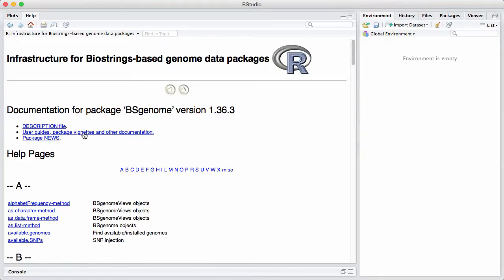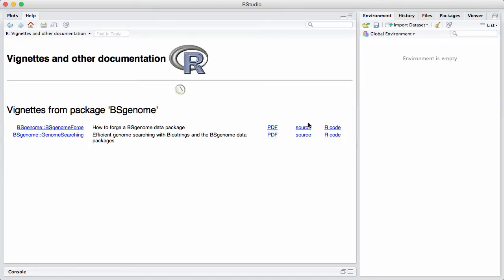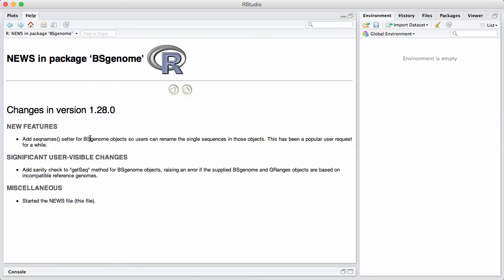So let's click on the vignettes. We can see this package has two different vignettes: something called How to Forge BSgenome and then Efficient Genome Searching with Biostrings BSgenome. Here we have it in PDF, some source code and the R code. There's also a link to the package news. Again the author started the news file and didn't really add a whole lot of information since he wrote it. So these are two good examples I guess that the news file can sometimes be of limited utility.